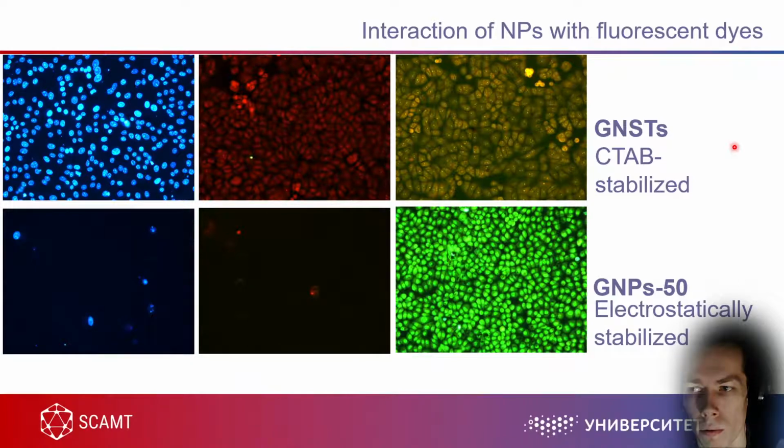And what is again so special about acridine orange is that it's not just DNA in green and RNA in orange or red. It also reports acidity: in acid conditions it's red, and in normal conditions it's green. So a difference in pH can be detected using acridine orange.